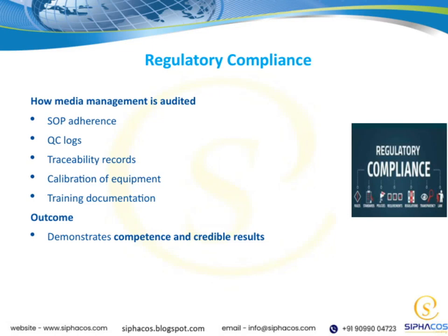Now, let's talk about regulatory compliance and how we ensure that our media management practices are properly audited. One key aspect is SOP adherence, which means following our standard operating procedures consistently to maintain quality and reliability. We also keep detailed QC logs, which help us track quality control activities and identify any issues early on. Traceability records are equally important. They allow us to trace every step of the process, ensuring transparency and accountability.